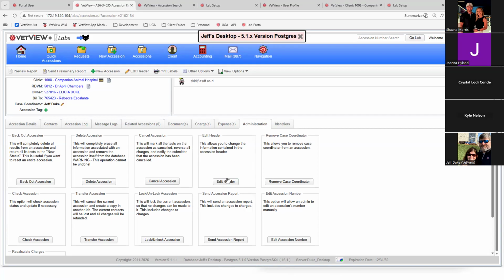If you need to just update a contact header, but you don't want to refinalize the case, you can do this. And there's different things here. You won't have to go through each one of them. I think they're self-explanatory, but each one of these buttons is a privilege that you can give people to operate on the session either while it's working or maybe when it's finalized. Because once it's finalized, it locks down everything in the system.